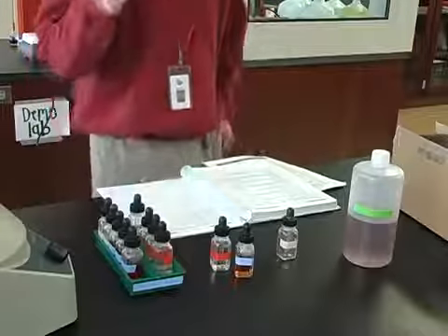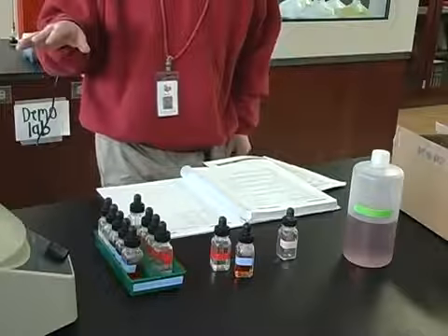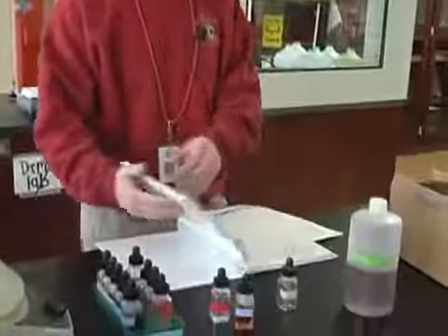So you can see how this lab is made to actually teach you some other chemistry that you might not know. That, hey, lead chloride, usually a precipitate, will actually dissolve in hot water. A good way to separate it from silver chloride or mercury chloride. Okay, question number 2.